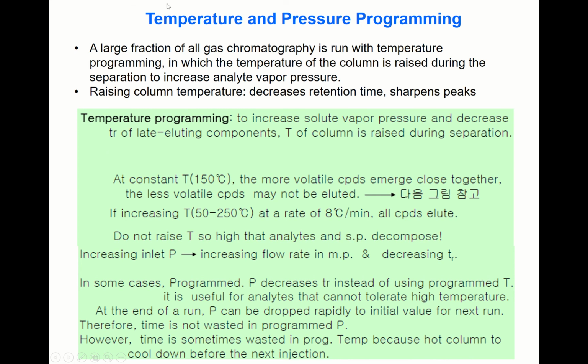A large fraction of all gas chromatography is run with temperature programming. This is quite usual practice, in which the temperature of the column is raised during the separation to increase the analyte vapor pressure. Usually you program the temperature of the column.